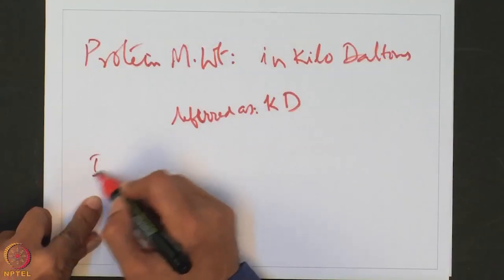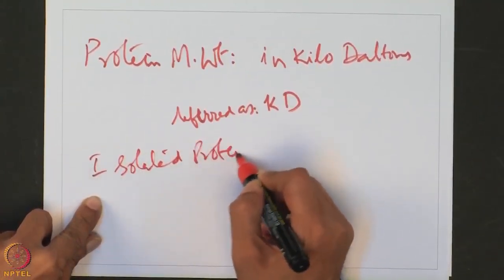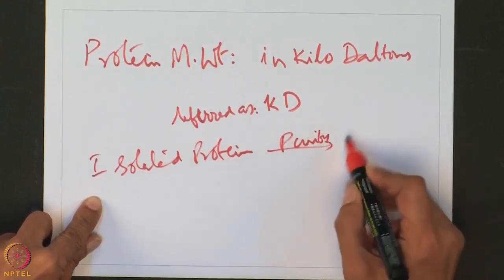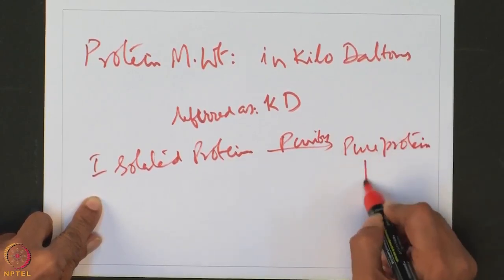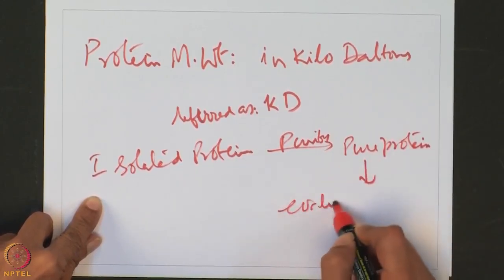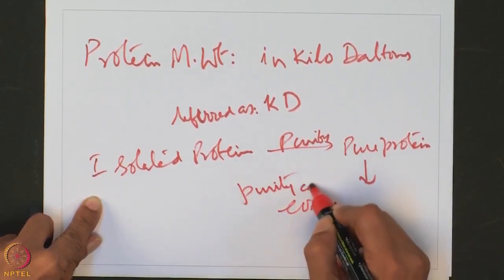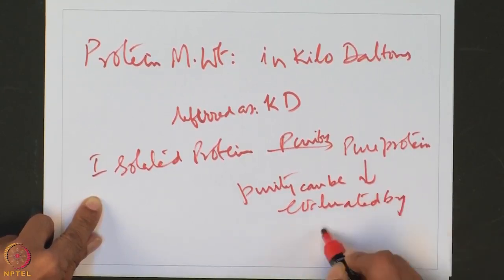So isolated proteins are purified, then you get a pure protein. This purity can be evaluated by MALDI.